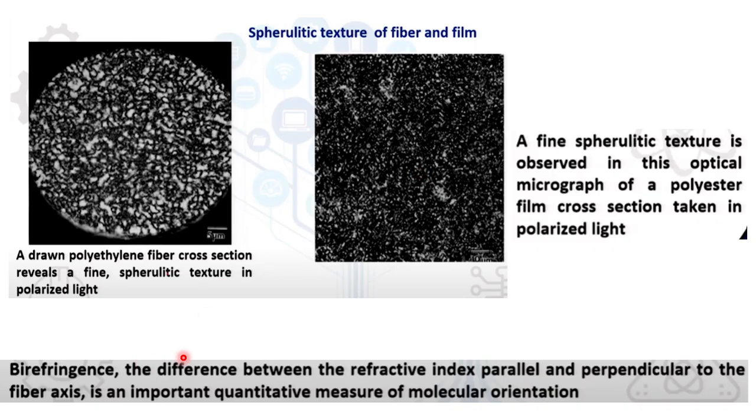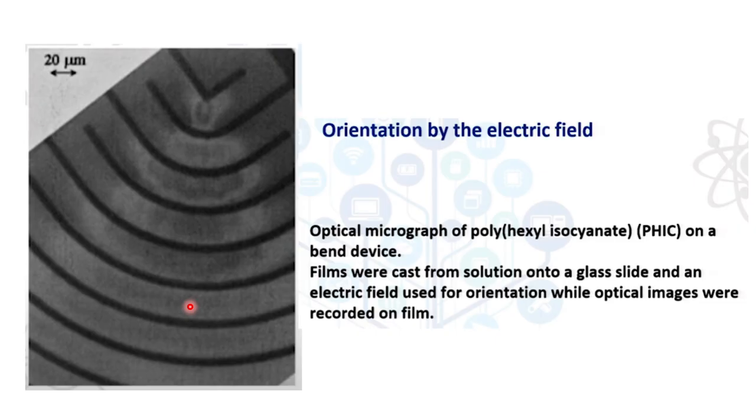So that's why birefringence is very much important. And with this optical microscope, you can get the idea how crystal is growing, or how the fibers or crystalline material are dispersed in a composite. Another important thing, whenever someone is making an extruded sample, through the extrusion, how the fibers or other fillers are orienting, that idea you can also get through optical microscope.